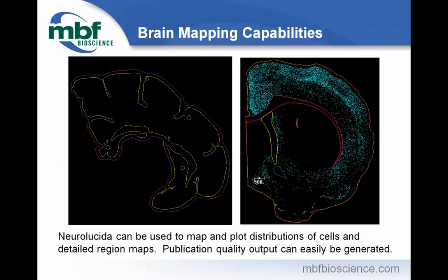So what is brain mapping? It's a methodology that can be utilized to understand the anatomical organization and distribution of cell populations within regions. Brain mapping is used for many reasons: to map a particular circuit or projection pattern using an anterograde or retrograde tracer, identify the distribution of implanted stem cells, or to locate cells using a particular reporter like GFP or that produce a particular protein like calretinin. These are just a few examples.